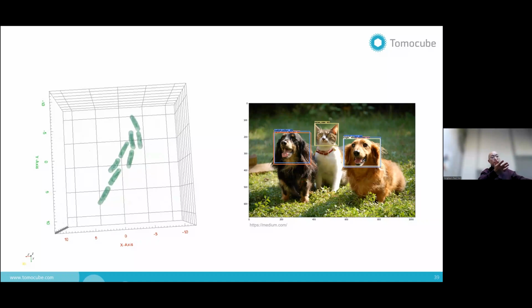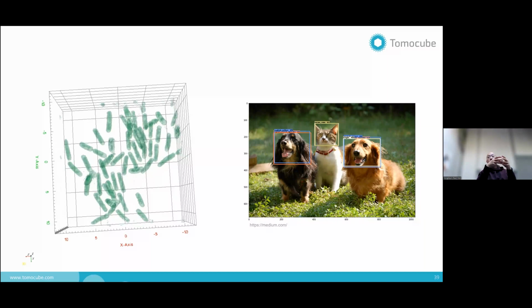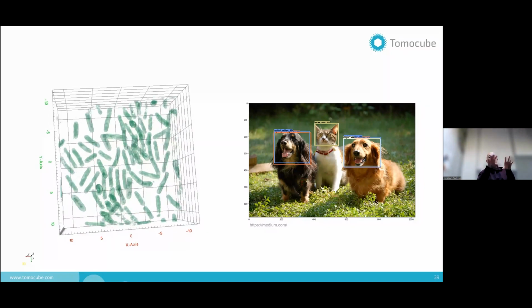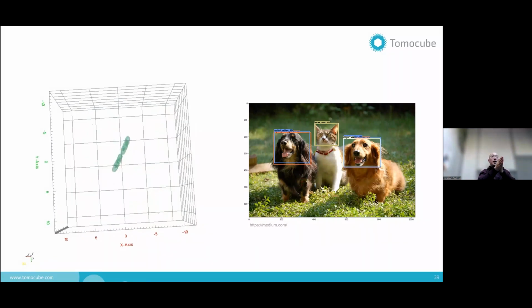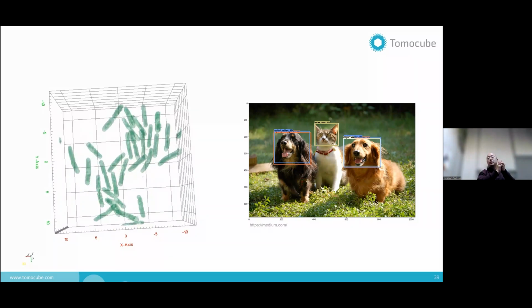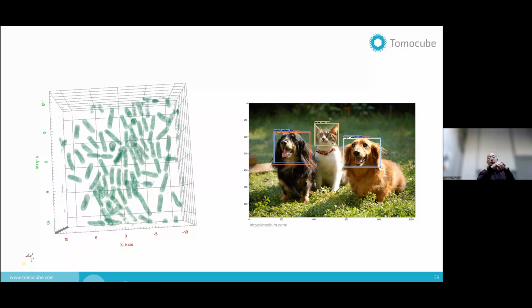we can see inside the bacterial cytoplasm. So we thought it might be possible to utilize this information for bacterial species classification. As you know, bacterial cells have a similar shape, so by using a conventional bright field microscope, it is not possible to differentiate bacterial species.